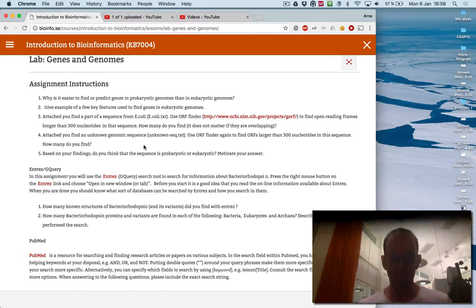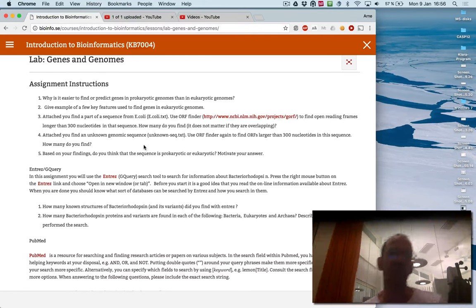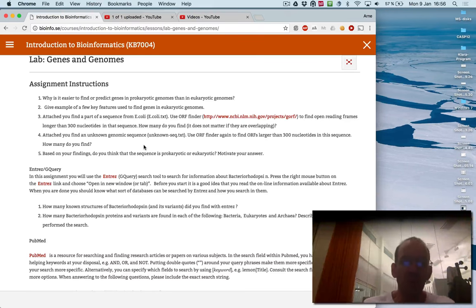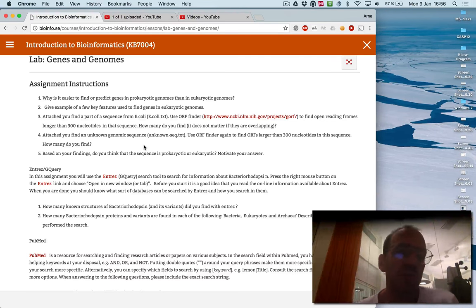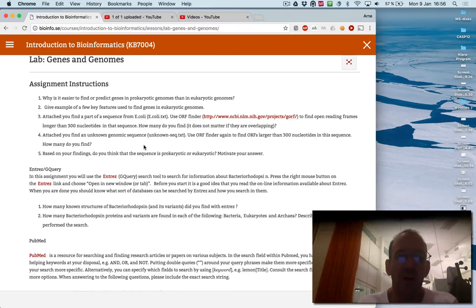So this is the first bioinformatics lab. It's called genes and genomes. You're just going to do a few simple web searches on different places to figure out an idea of things you can do.